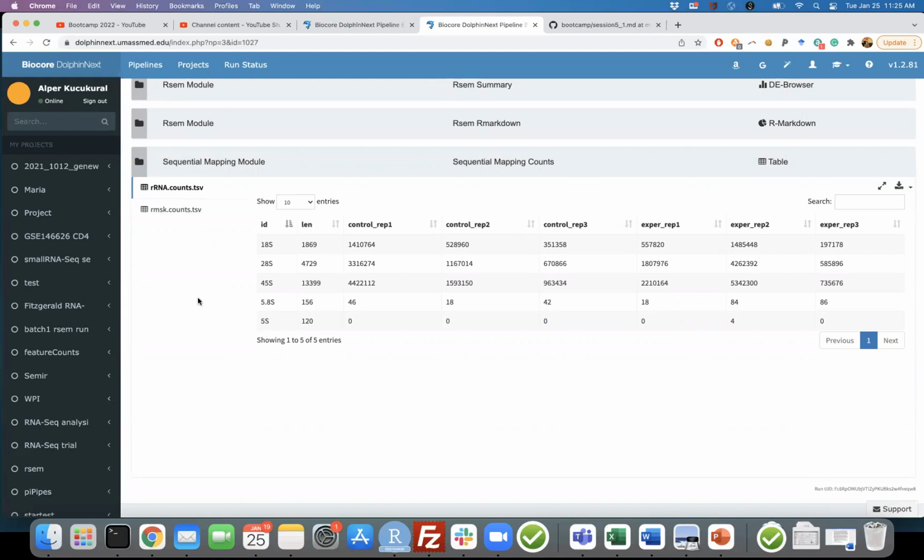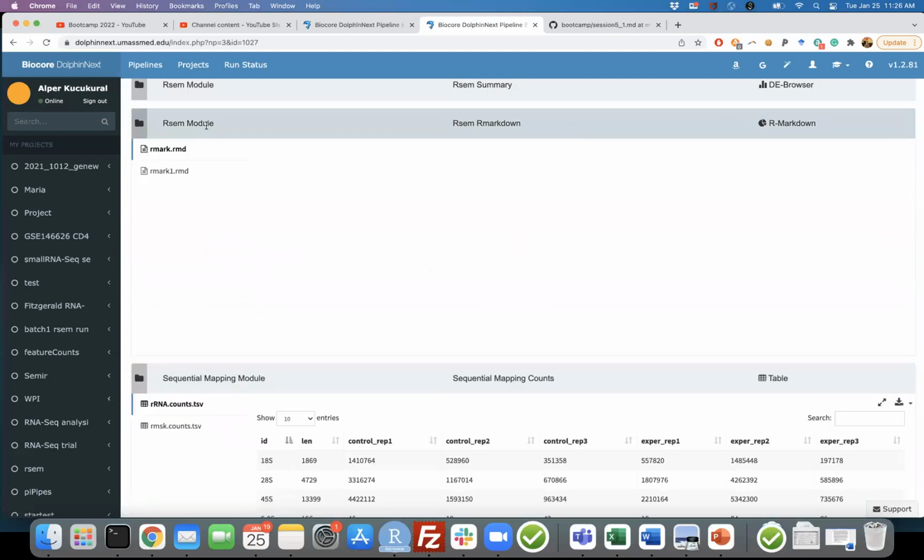For example, you put in your flu sequences or HIV sequences or COVID, and for each sequence you defined in your FASTA file there will be a line here. And then you're going to have the quantification for each sample of that specific sequence you put. People are even using this for tRNAs and doing differential expression analysis for tRNAs, to see if something is interesting after they perturb the cells versus wild type, for example.